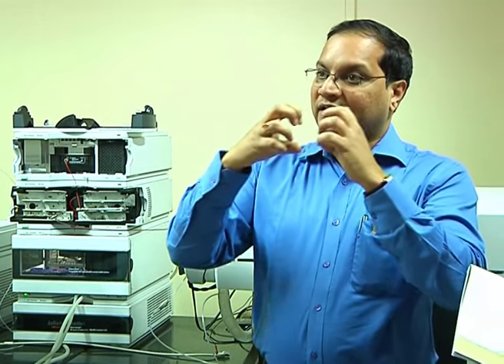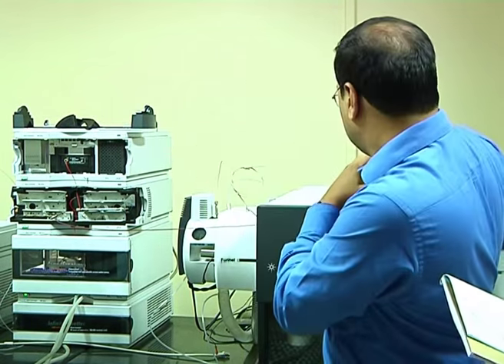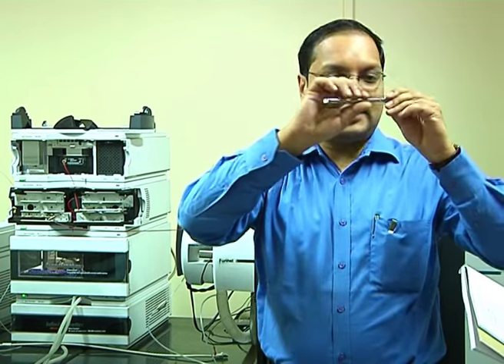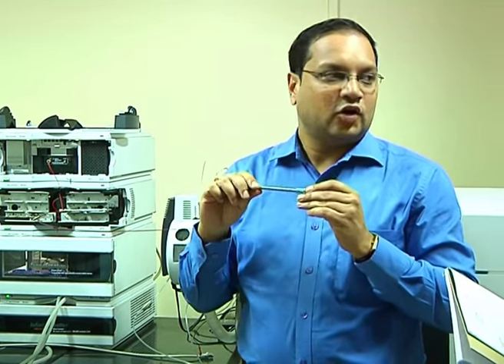To reduce that complexity, we use a separation technique before an MS so that your peptides get retained based on their hydrophobicity in the stationary phase, which we call the HPLC column. If anyone has not used an HPLC, it looks like this. It has some stationary phase, typically silica-based C18, depending upon what type of chromatography you are doing.